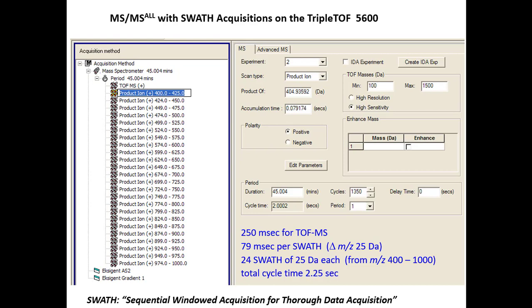So then, here, these are your windows. You have the slides in the folder, so you can see, I will read this real quick, 400, this was when we still did 25 m/z windows, right? So we would maybe do 24 windows of 25 m/z from 400 to 1000. But now we do variable windows, and I'll show you those afterwards. But here you do 400 to 425, 424 to 450, 449 to 475. So you'll always have a 1 m/z overlap. And for the segments, it's like half an m/z on each side.